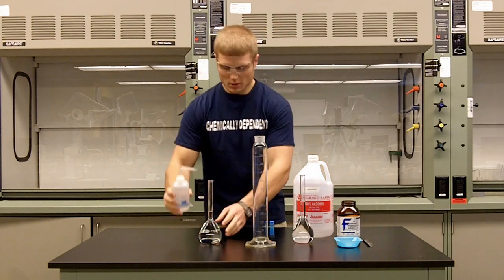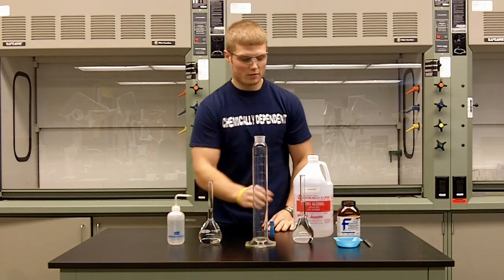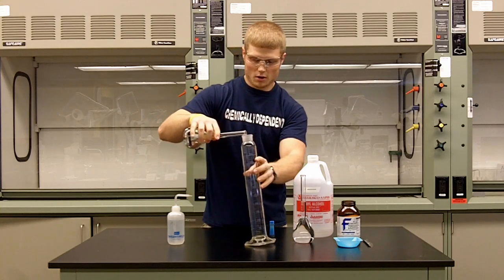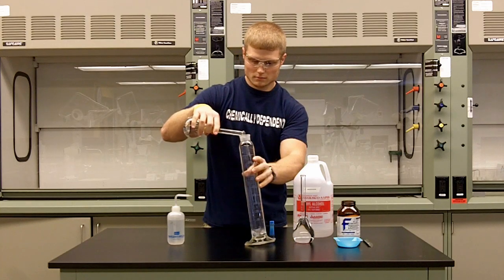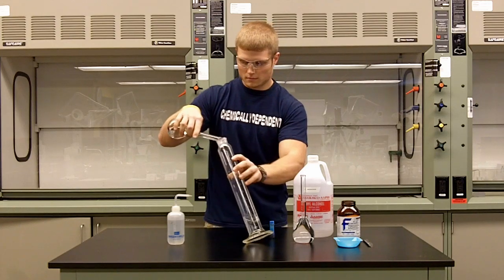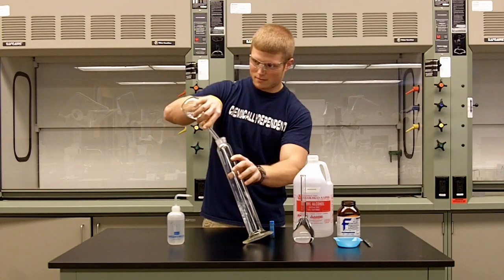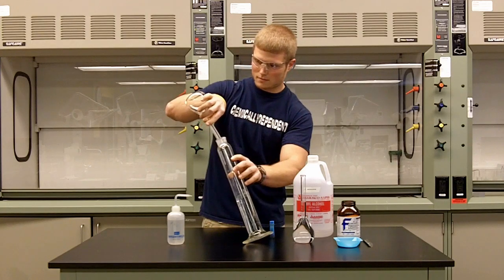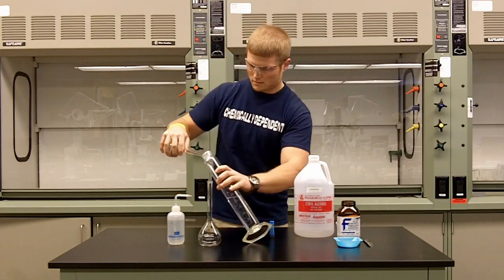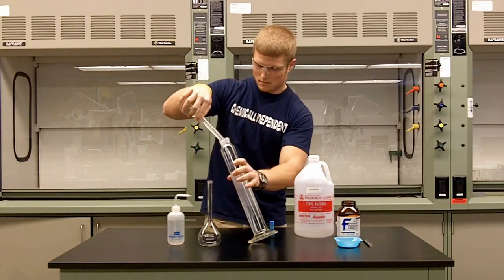So here we have 250 milliliters of water, measured with a volumetric flask, so it is exactly 250 milliliters of water and 250 milliliters of ethanol. We're going to pour these into our graduated cylinder.